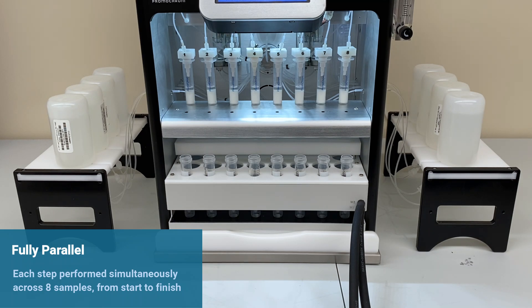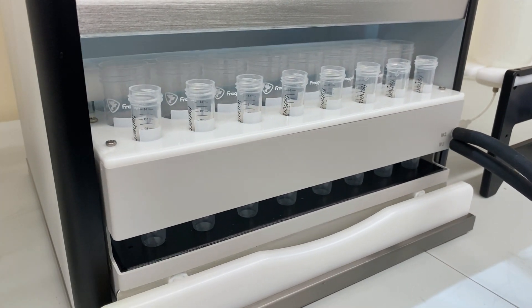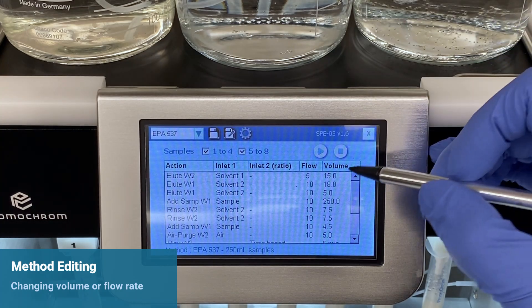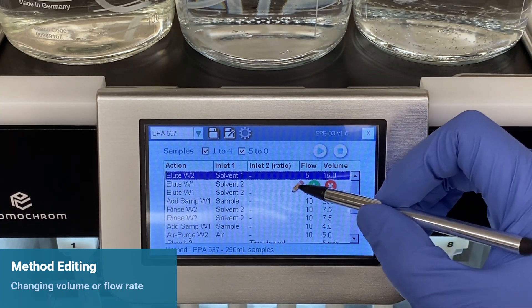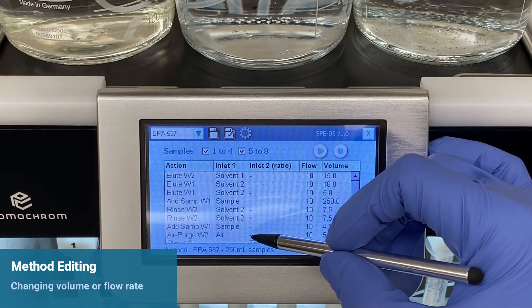For EPA Method 537.1, it takes approximately 75 minutes to have all eight samples extracted. To change method parameters, such as volume and flow rates, simply tap on the method step, edit, and save.